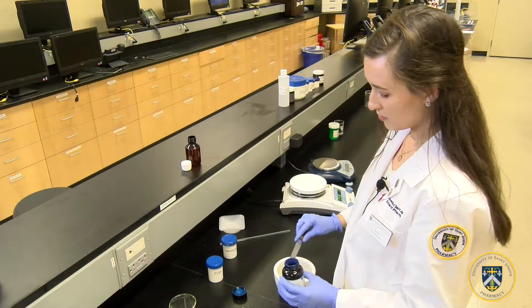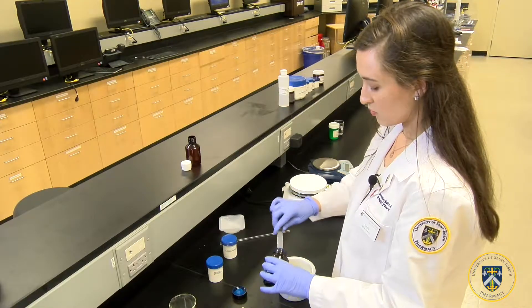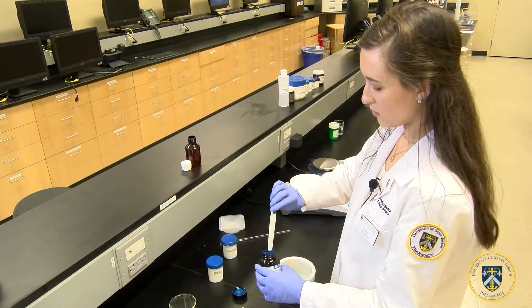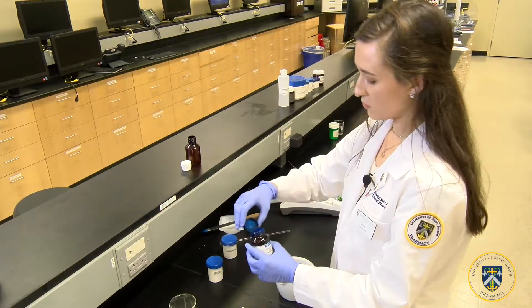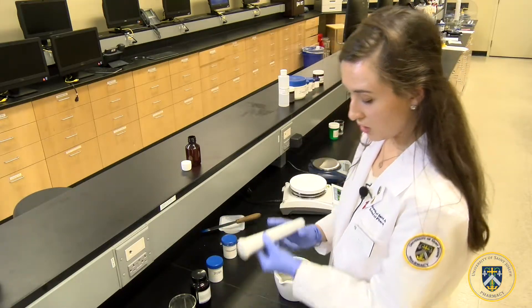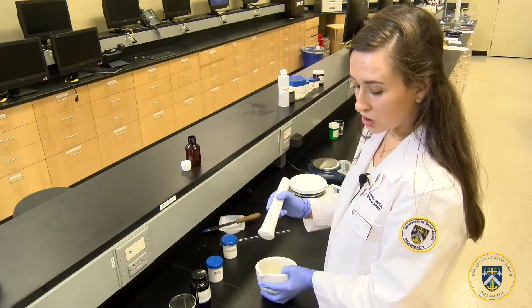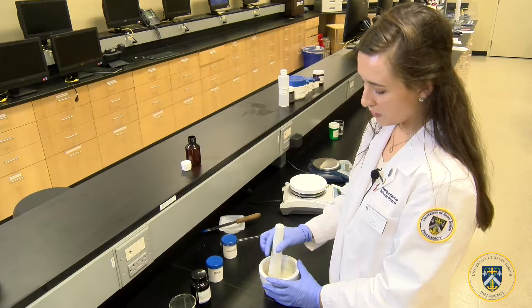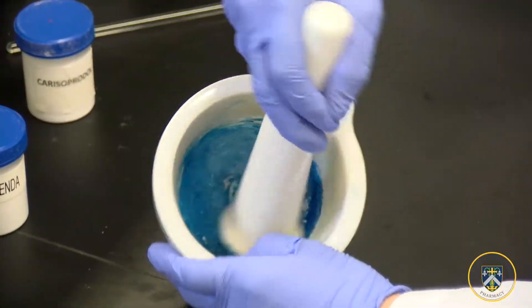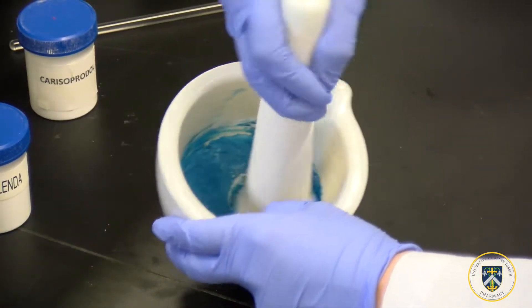Now that we've added the three ingredients to the mortar, we will triturate using the pestle in a circular motion until all the ingredients have formed a fine powder and the color is uniform throughout.